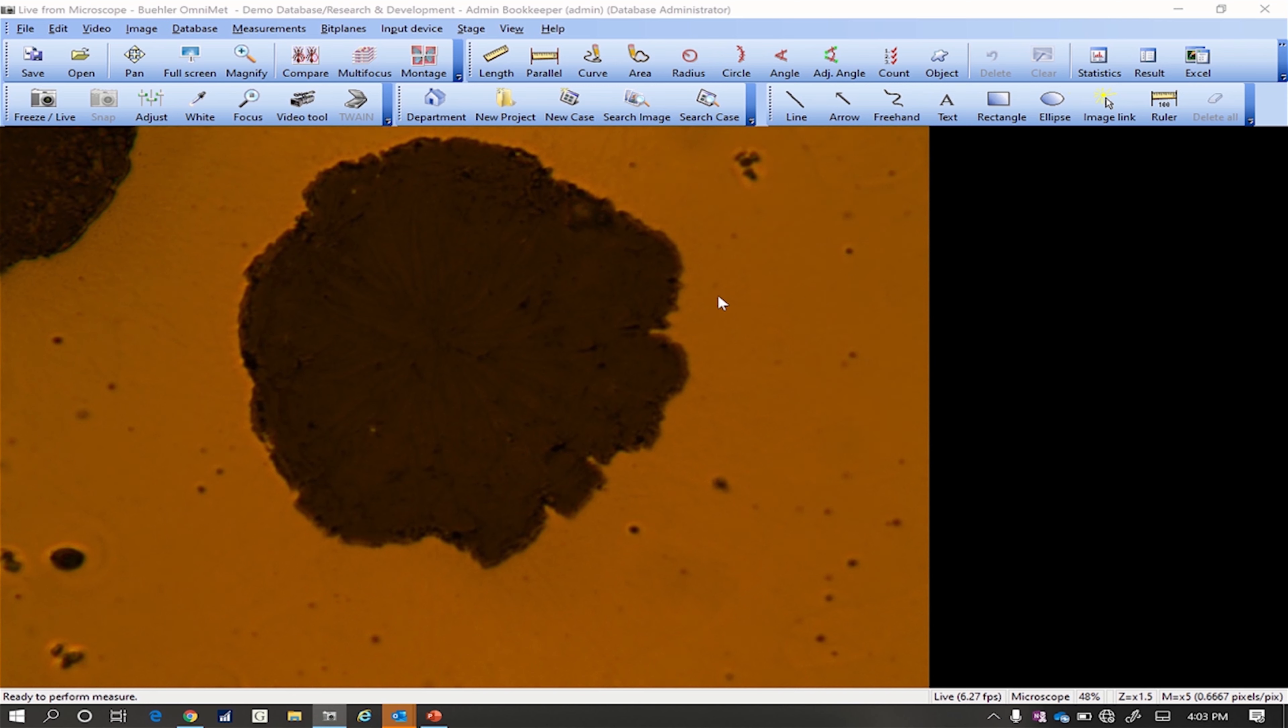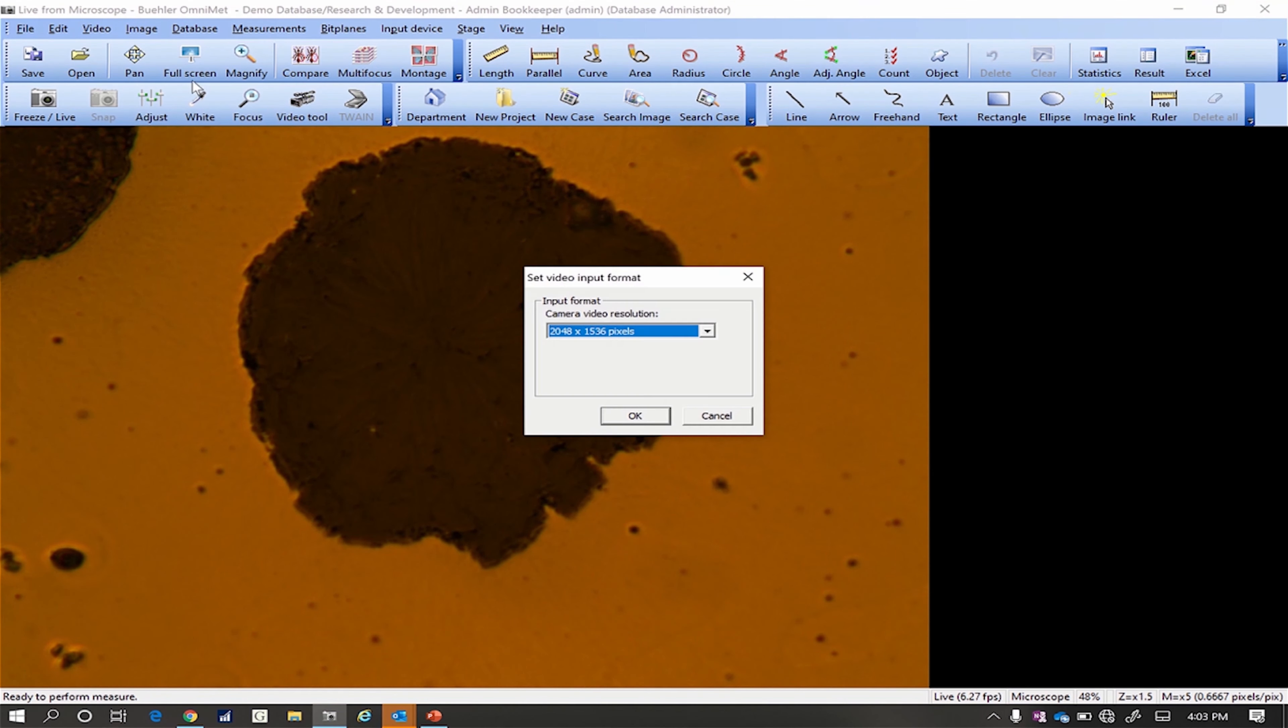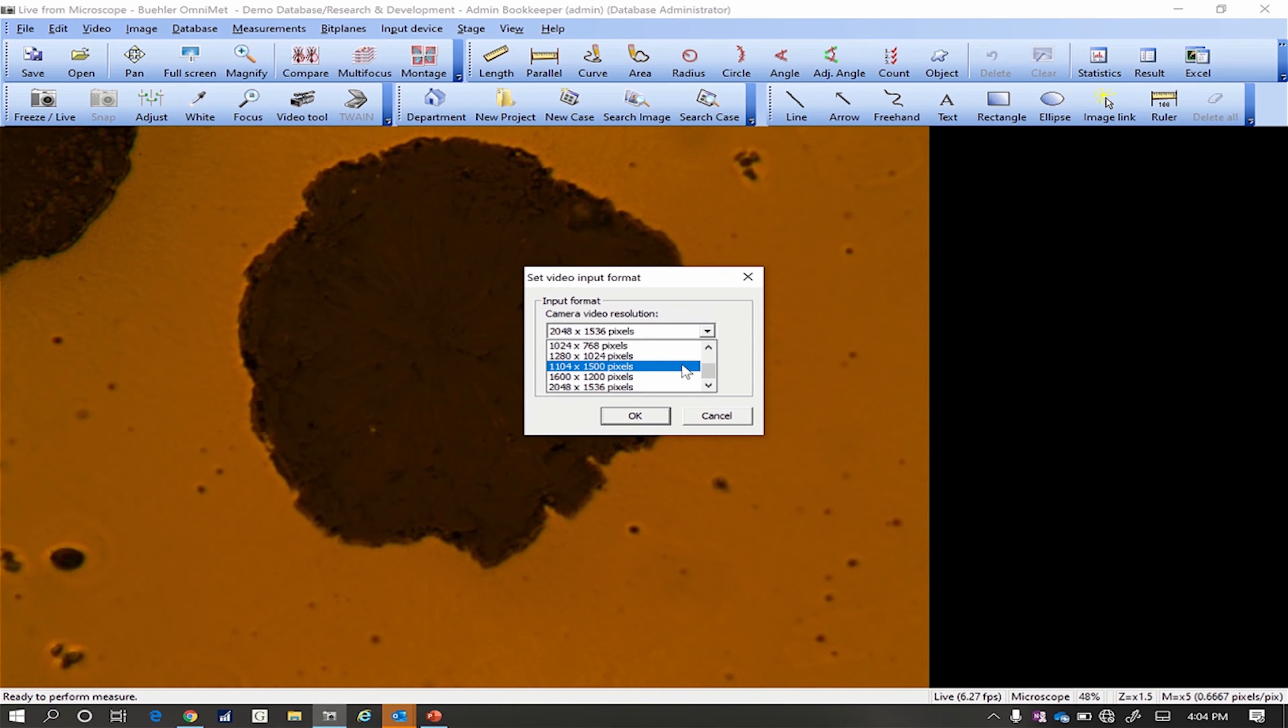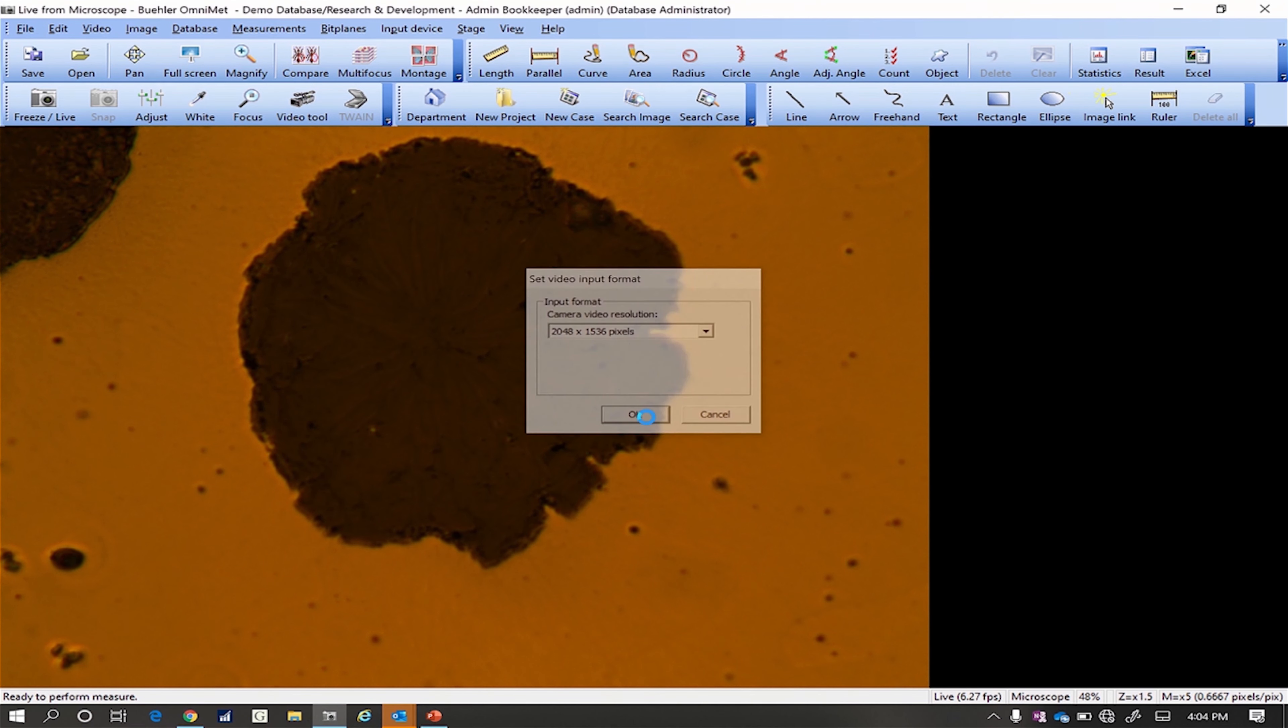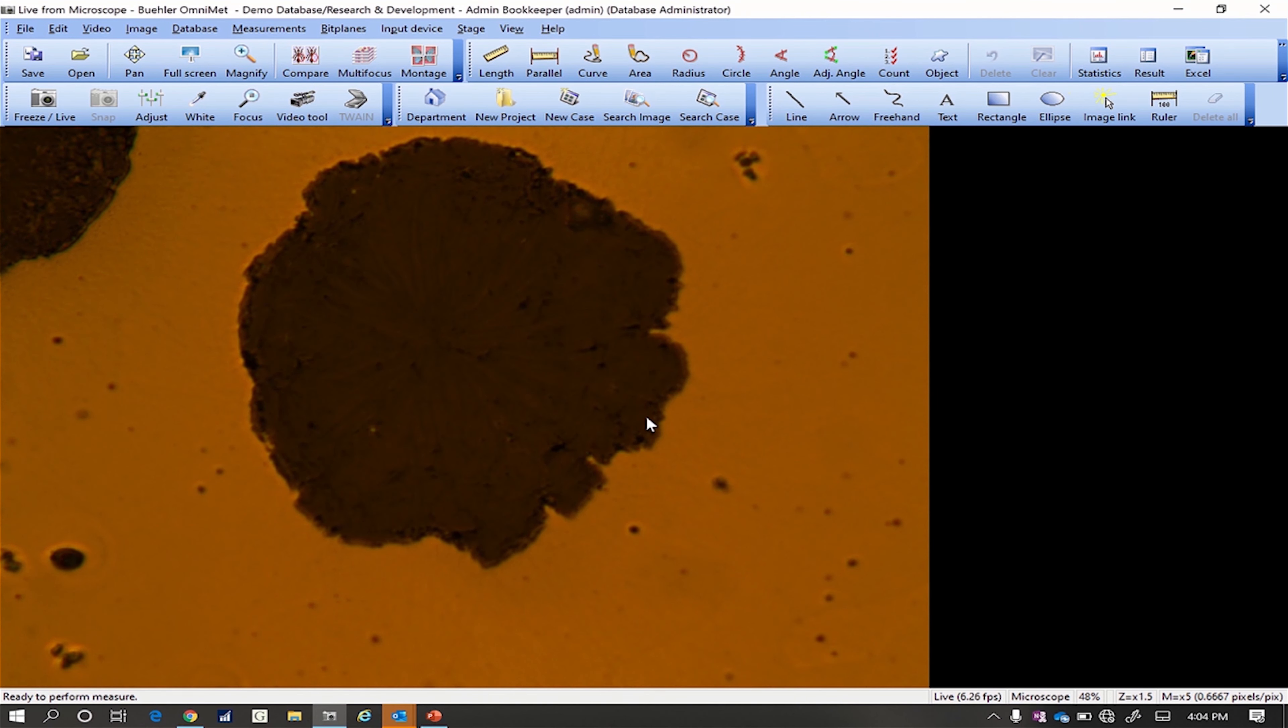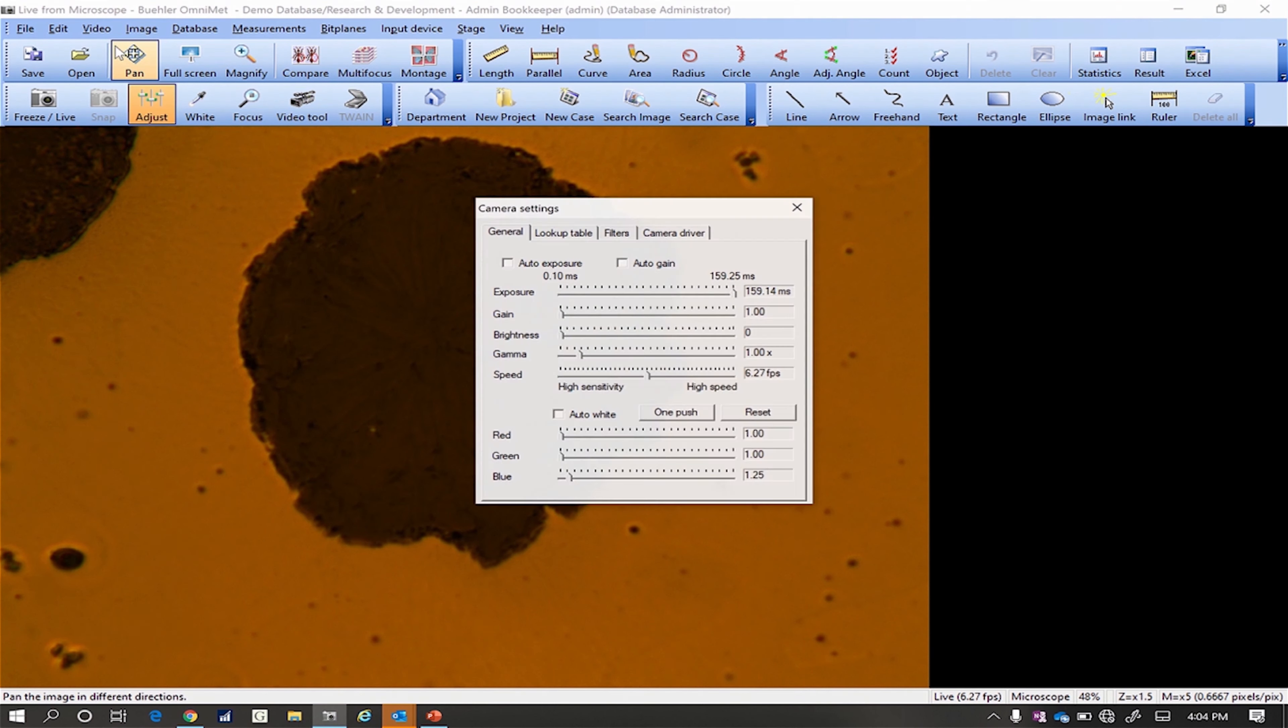First, we should ensure that the camera being used is set to the correct resolution, usually the highest possible. Next, we can adjust the camera settings under Video, then Adjust Camera Settings.